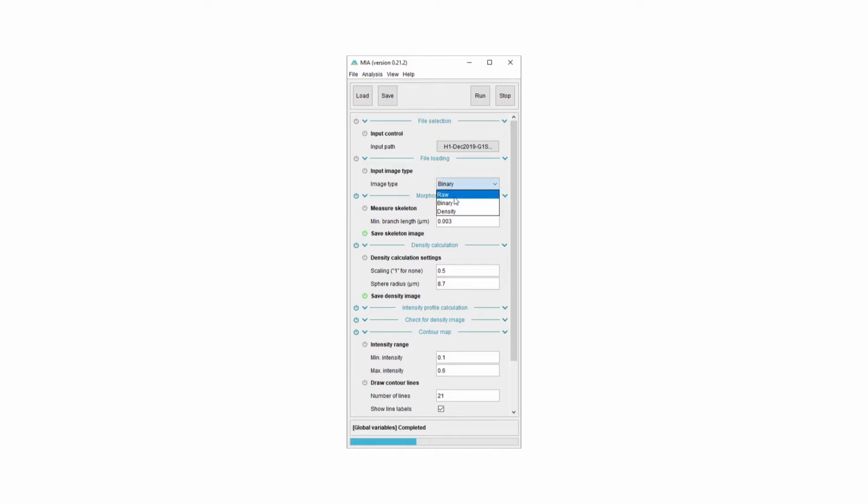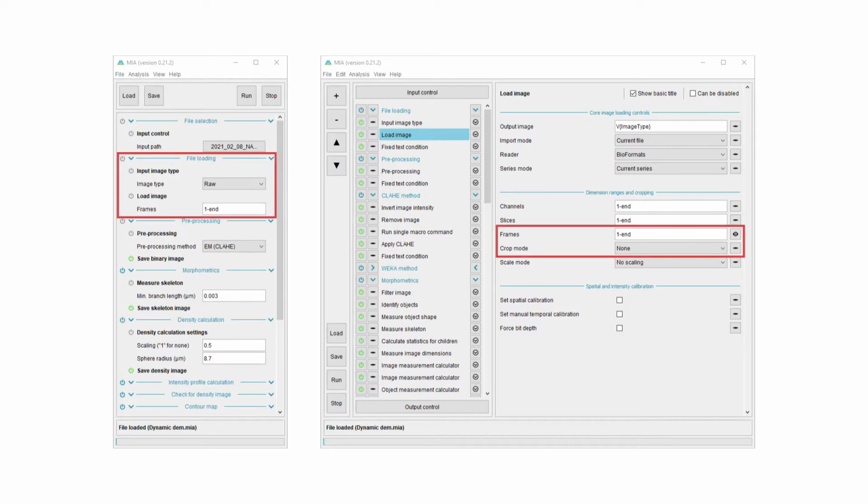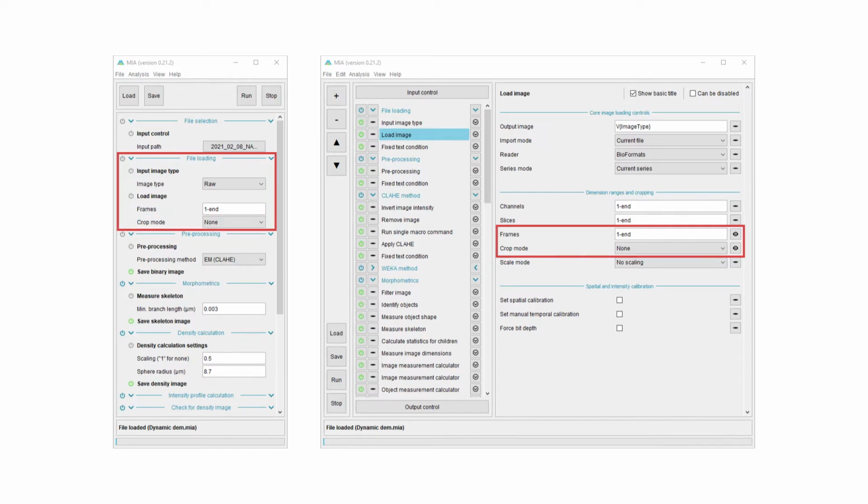On the other hand, for end users, there's the processing view, which can be configured by the workflow creator to display just a small subset of controls. For example, those required to run the analysis on new images, such as file selectors. Any controls can be easily added to processing view using the toggles from editing view. With this, it's straightforward to distribute analyses to other researchers who maybe aren't so familiar with image processing.